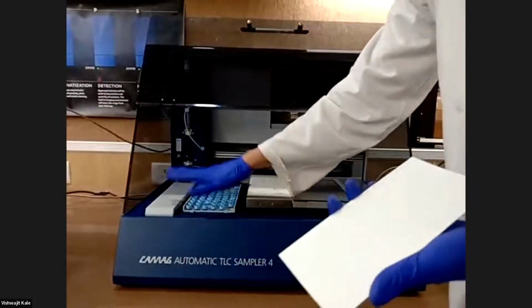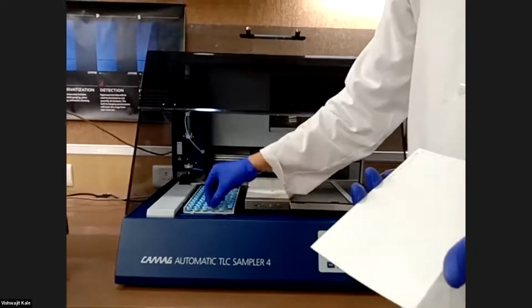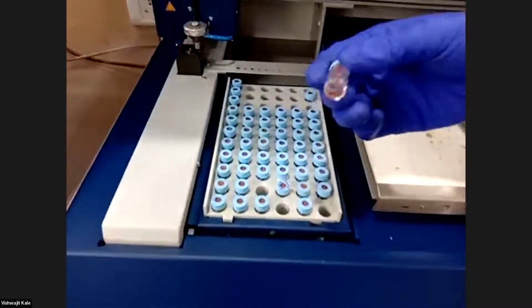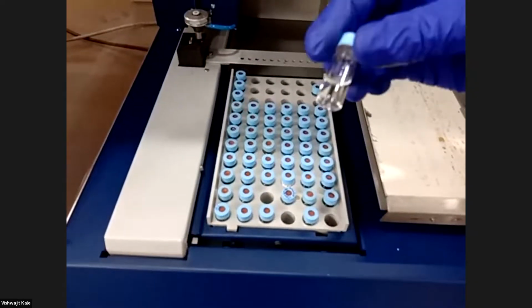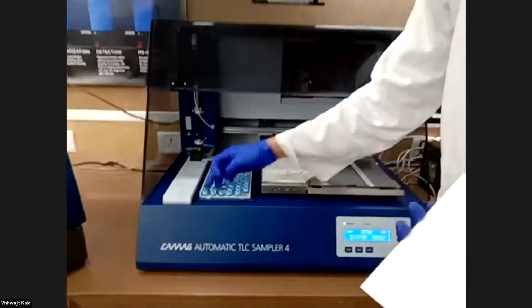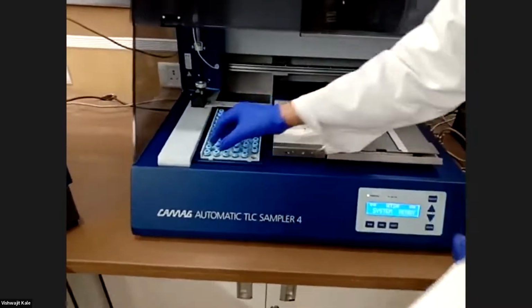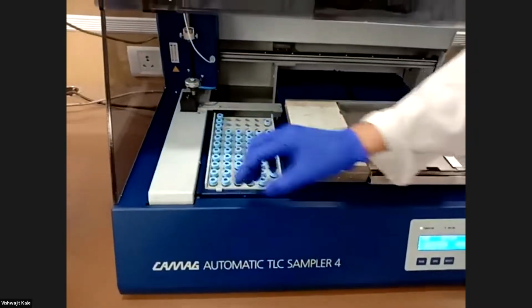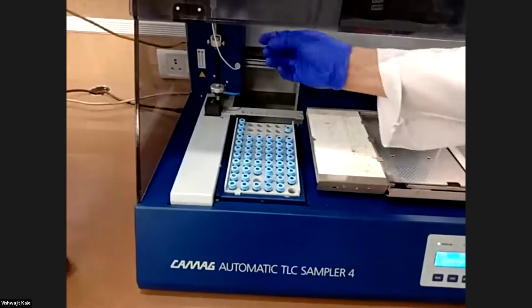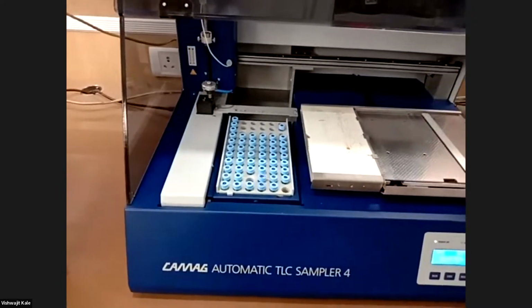After that, this is ATS4 along with the auto sampler tray. In this tray we can accommodate 66 vials at a time, and in each vial we can fill 1.5 to 2 milliliters of our sample, and positions are given as A1, A2, A3, B1, B2, B3. Total 66 vials we can keep, and as per our requirement, from any suitable vial, the syringe will go in, take the sample and apply it on the plate.